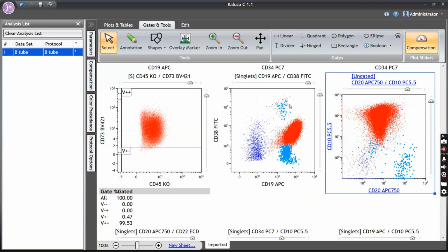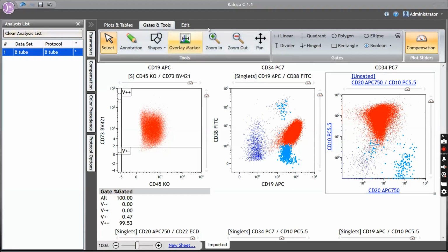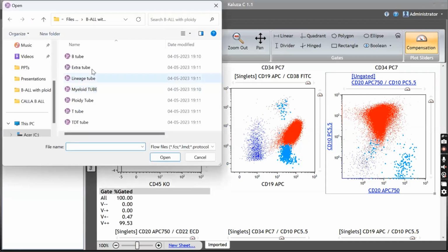Okay? Does that answer it, Dr. Crystal? Okay, so not too many cyto markers. If you have a 10 color panel, don't put all the cyto markers in one particular tube. Just add 3 markers in one tube and another 3 markers in another tube. Okay, right. Any doubts beyond that? Are things fine? Let me go faster with the myeloid tube.